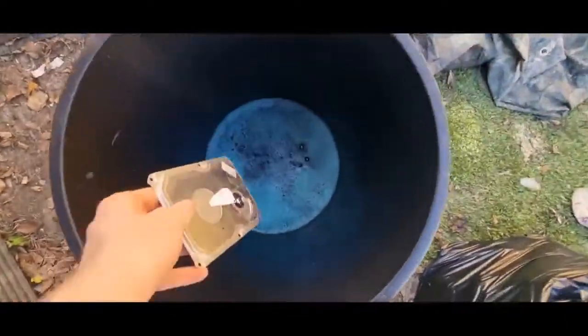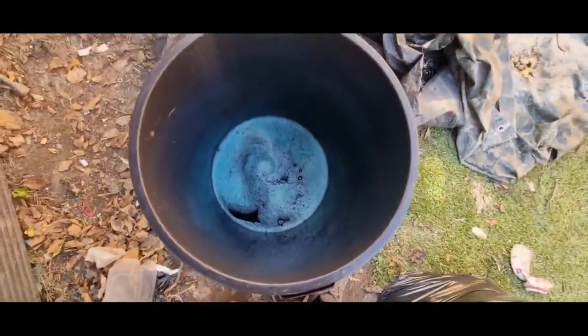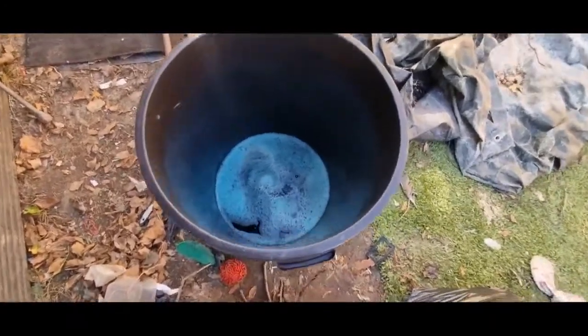I know this is steel, chuck it in anyway. You can see it bubbling already. I'm just going to put the lid on and leave it. If the bubbles weren't there you'd be able to see it reacting, but you can see it's fizzing. I'll come back later on when it's done.